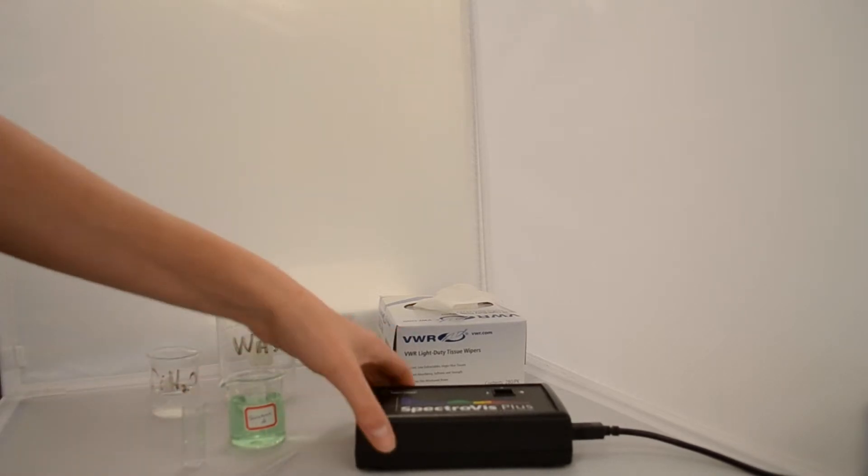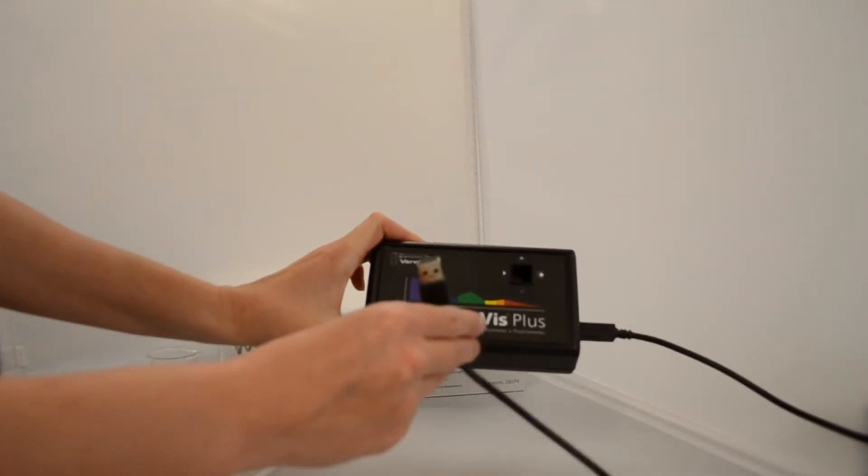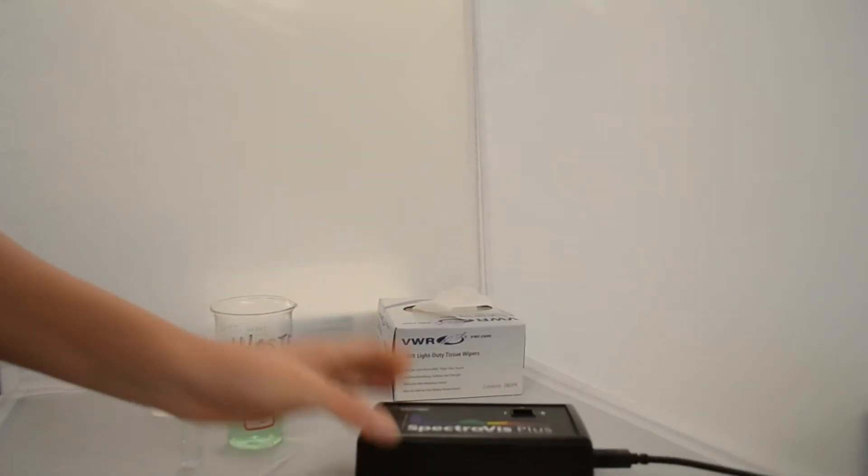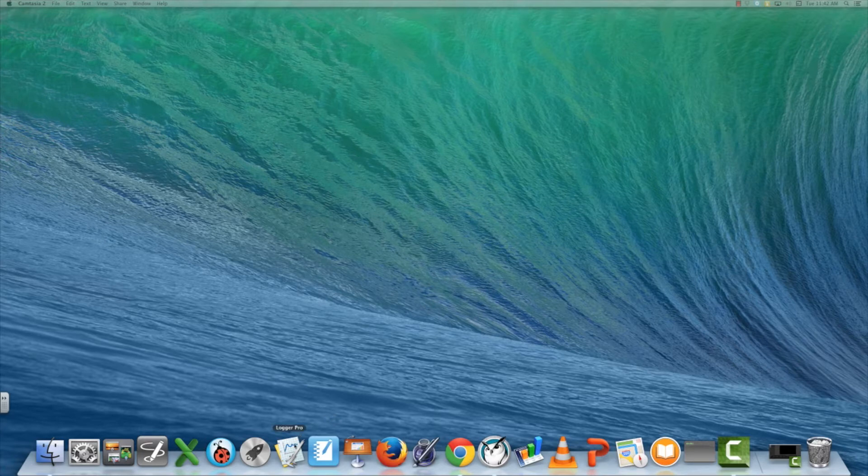First, you must calibrate the spec to prepare for your experiment. Use the USB cable to attach the spec into the computer. Open the Logger Pro application on the computer.